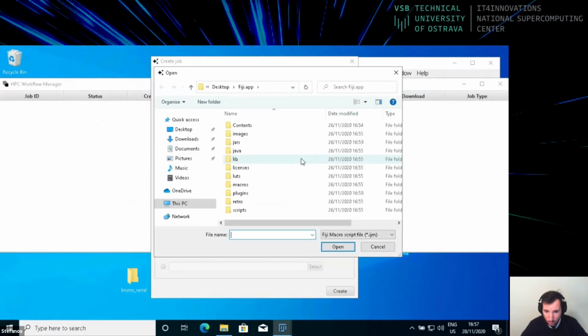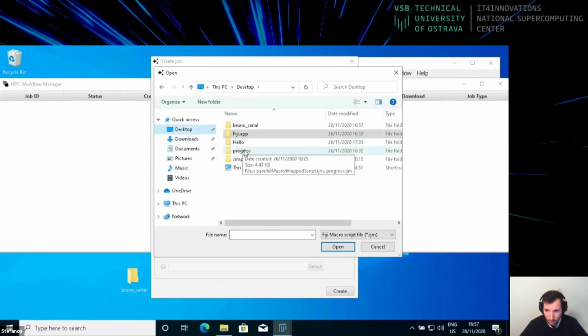Right click and create a new job. Select the empty directory we just created, the Bruno serial.